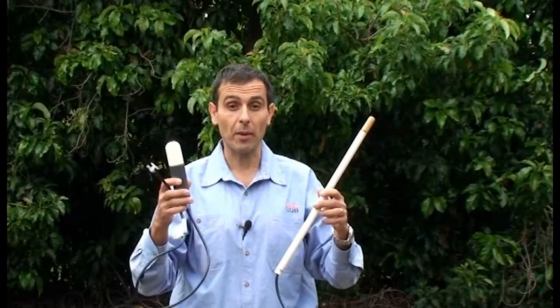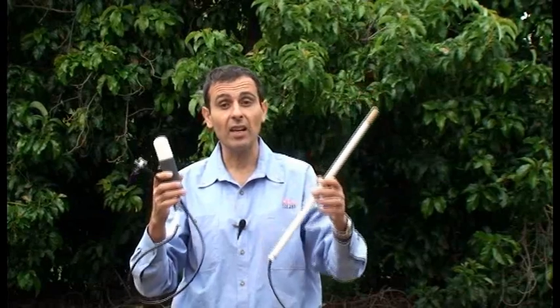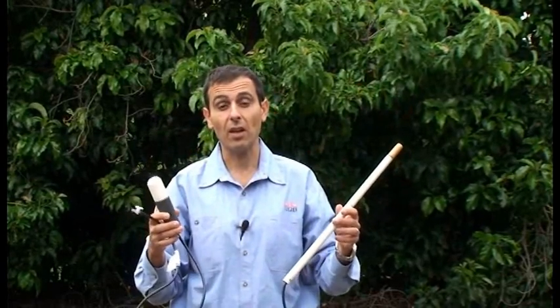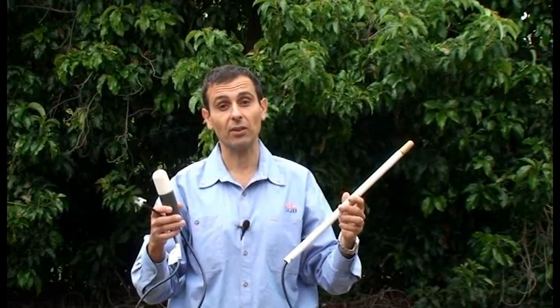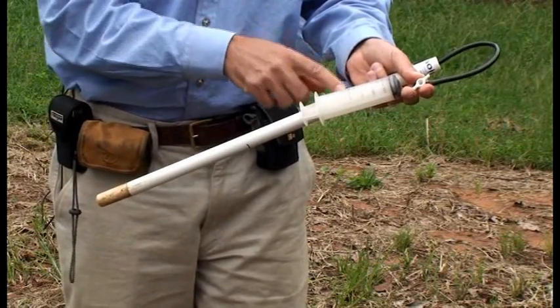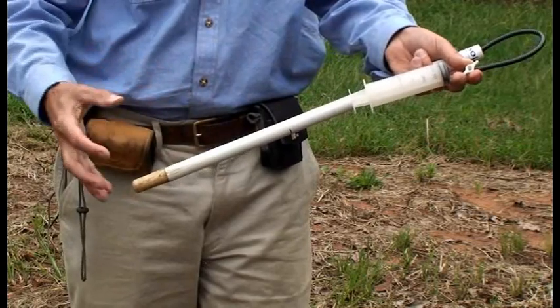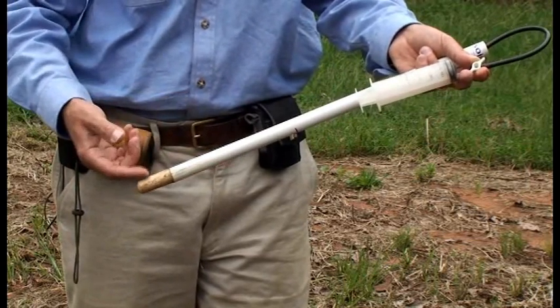There are various types of ceramic samplers on the market, such as this 20 millimetre wide sampler and this 40 millimetre wide sampler, and you can even make your own. The ceramic samplers can be installed at any depth in the soil. To extract a soil solution, air needs to be pulled out of the tube via the syringe. This causes a negative air pressure inside the tube, so over a day or so, soil solution gets pulled into the tube via the ceramic tip.